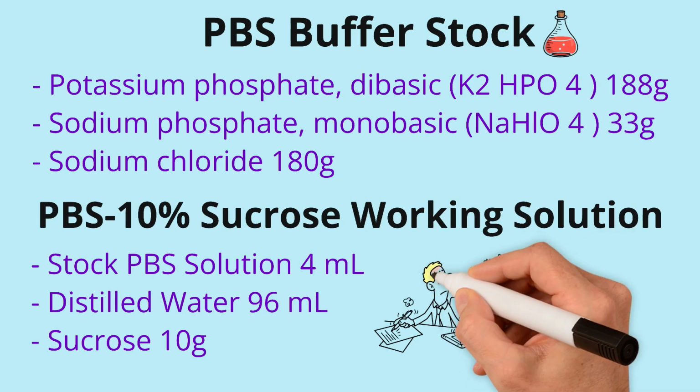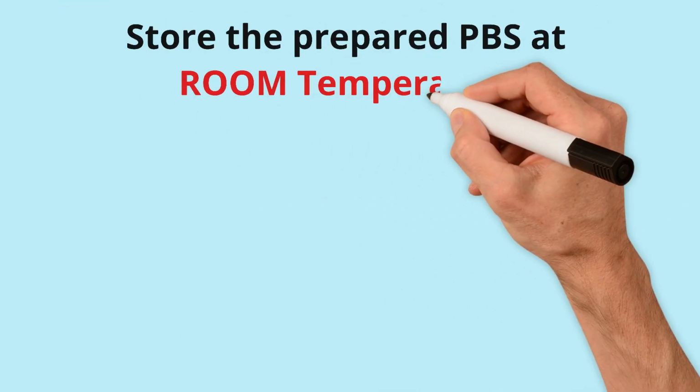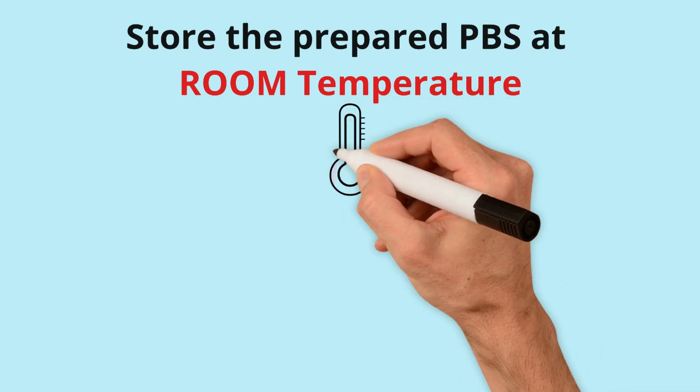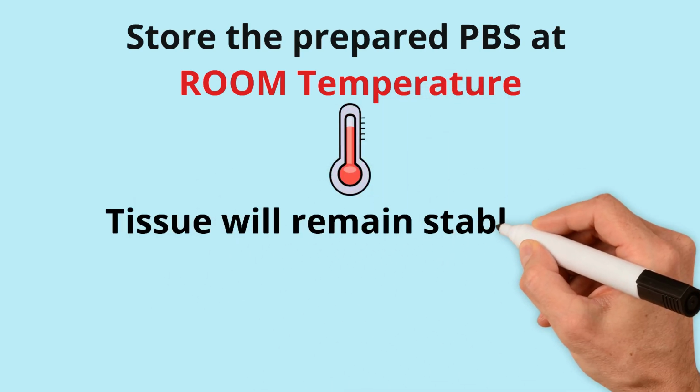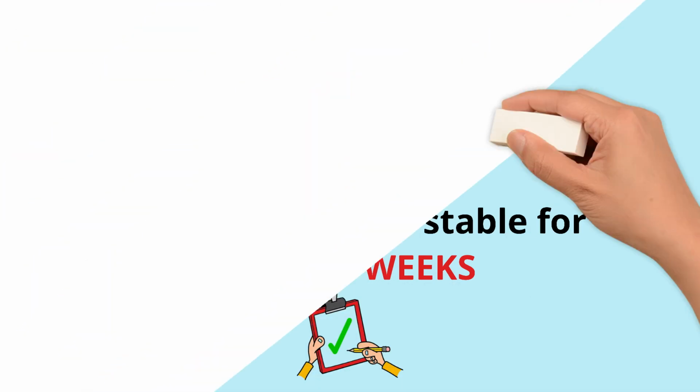Remember to store the prepared PBS at room temperature, and if you want to store the tissue in this solution, the tissue will remain stable for about 2 weeks without compromising immunofluorescence or immunohistochemistry results.